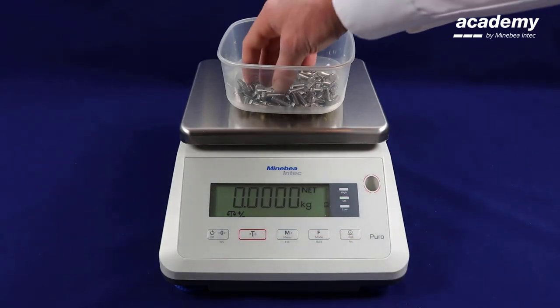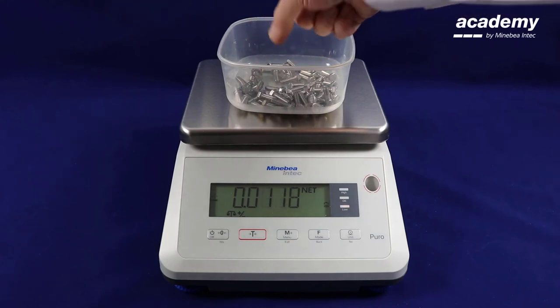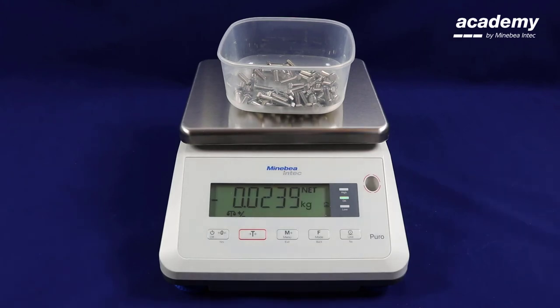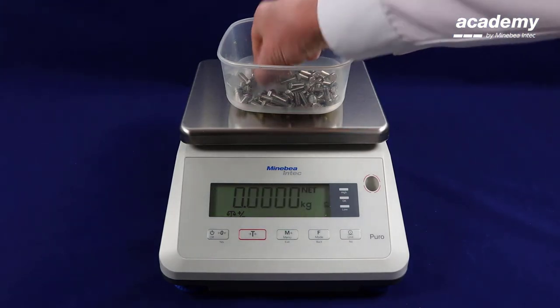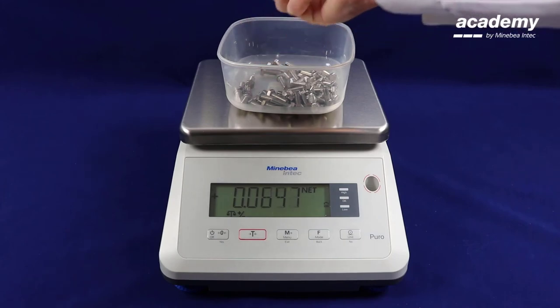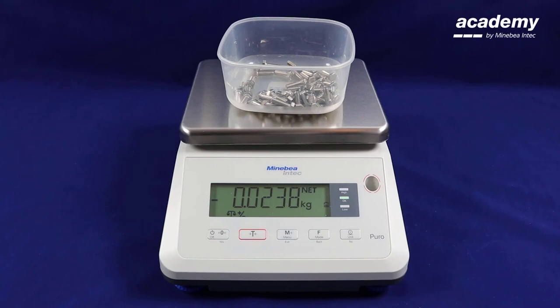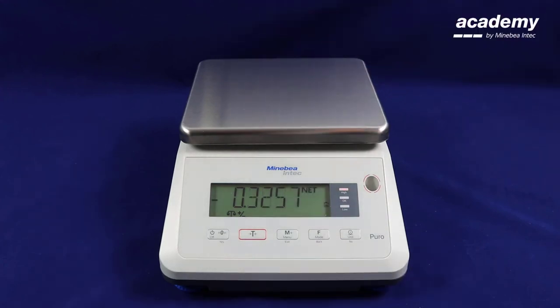You can continue this process by pressing tear. Once you have completed your weighing press zero to return the scale back to check weighing.